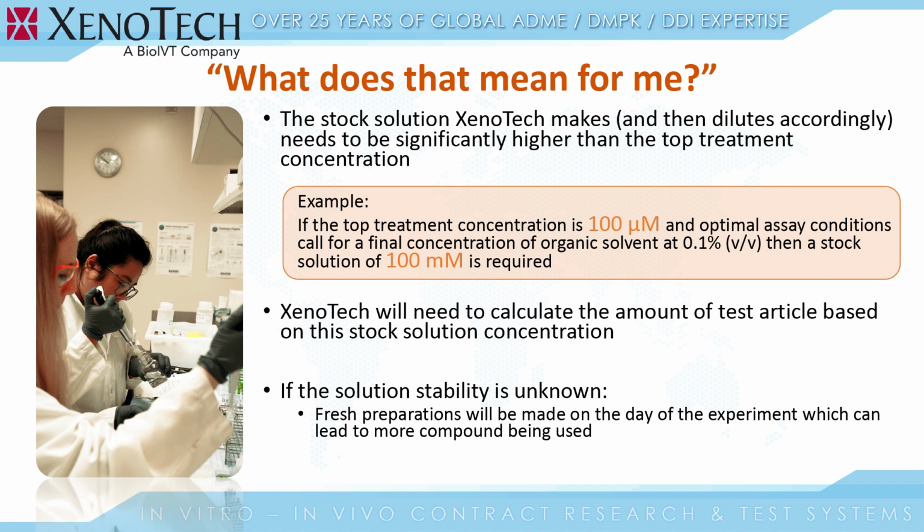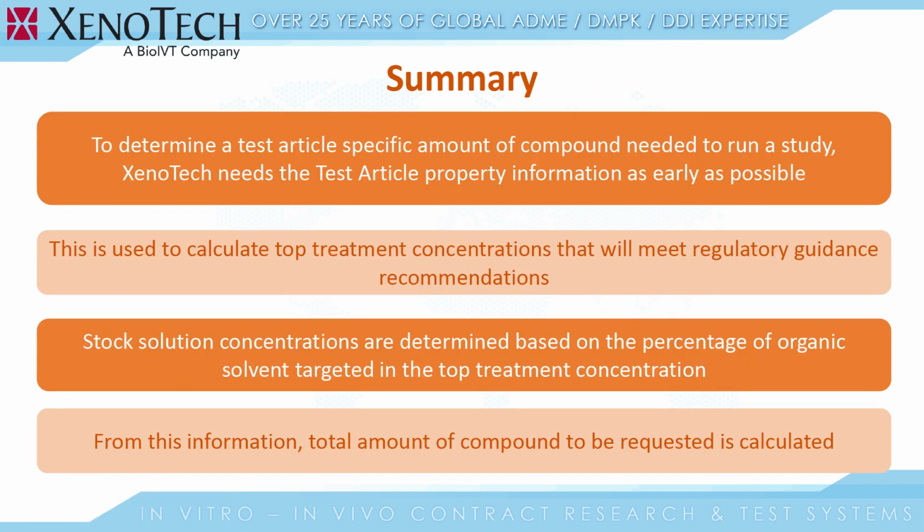And if solution stability is unknown, then we need to prep fresh concentrations all the time. We can't just have a stock solution prep sitting at 4 degrees. That's going to generate even more compound usage if we're having to continually make that stock solution fresh daily.